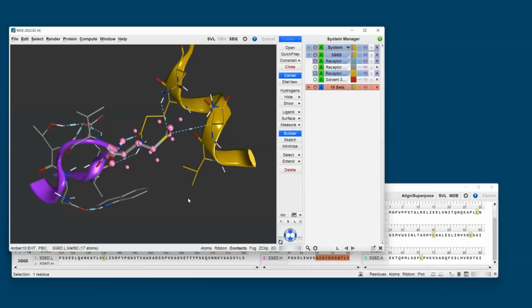Today we'll be exploring two different methods. The first is using Protein Builder, a good application for interactive analysis on single point mutations. The second uses Protein Design, a good application to perform multiple mutations and measure the impact of these mutations upon affinity and stability, whilst also calculating protein properties to assess any downstream developability issues.